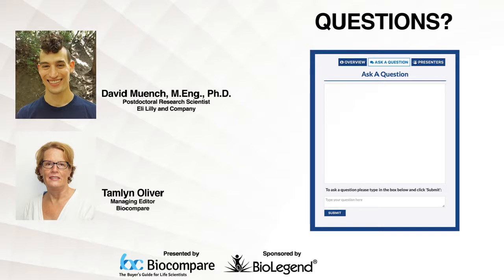Okay, thanks, David, for that explanation. The second question is, CITE-Seq and single-cell ATAC-Seq are powerful techniques. Can they be used in combination to analyze the same cells? And if so, is that what you did here?